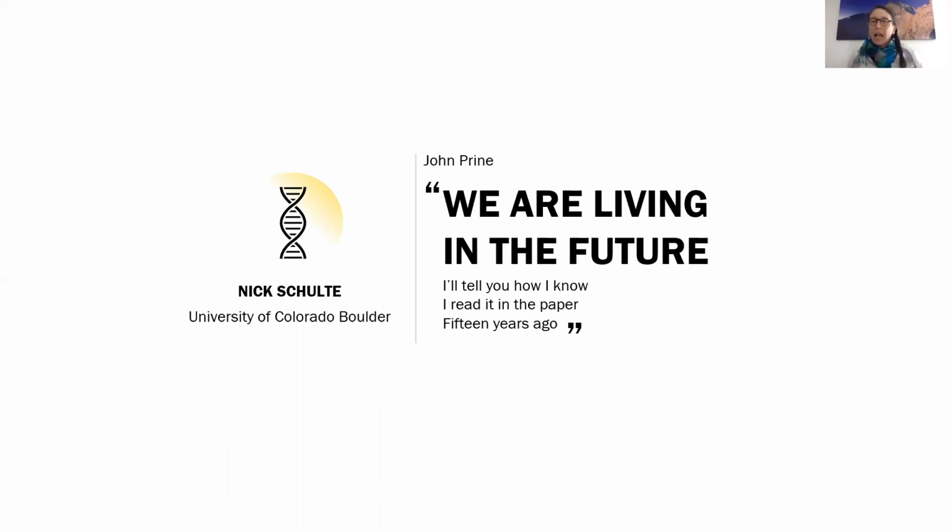So Nick, how much material do you recommend that people collect and store for later analysis, and how do you store that material? Great question. I had hoped to discuss this in more detail, but I had to trim it down. As you can see, I'm long-winded. So currently, I think it's sufficient for a biofilm to collect 2 milliliters of homogenized biofilm composite sample.